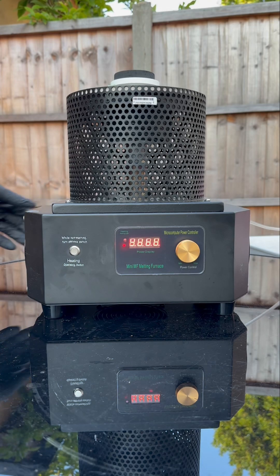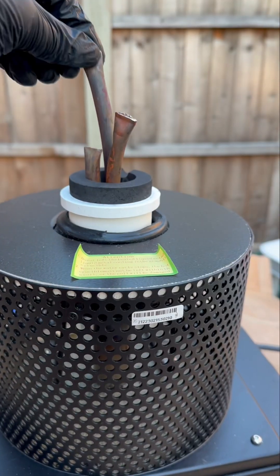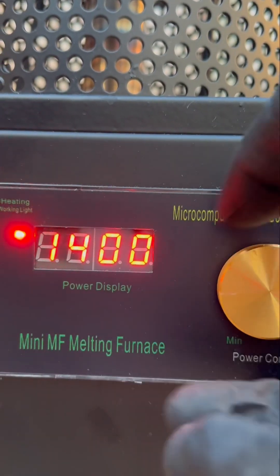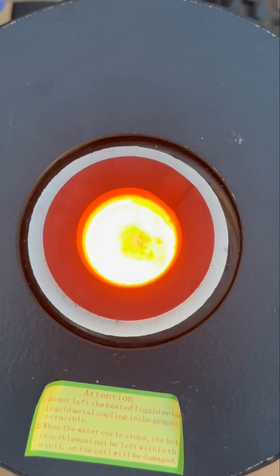So this is the furnace that we're going to use to melt the copper. We'll put the water pump into some water to keep the machine cool. Copper metal has a melting point of 1085 degrees Celsius.